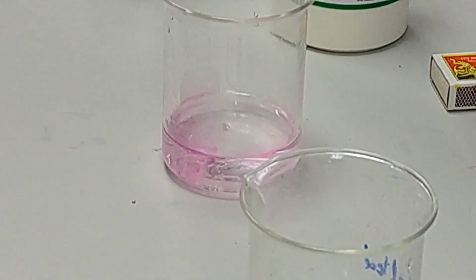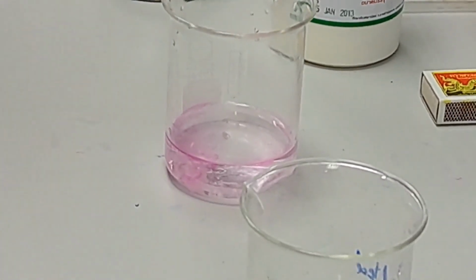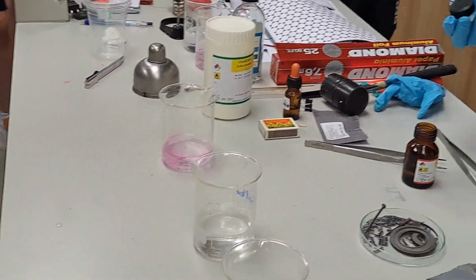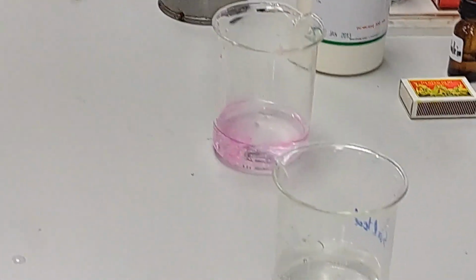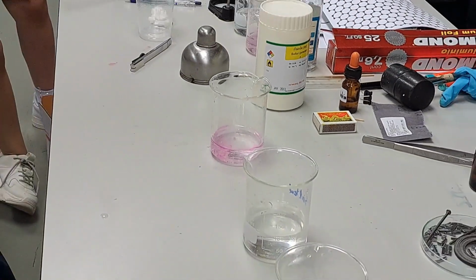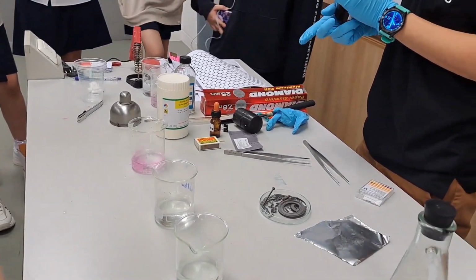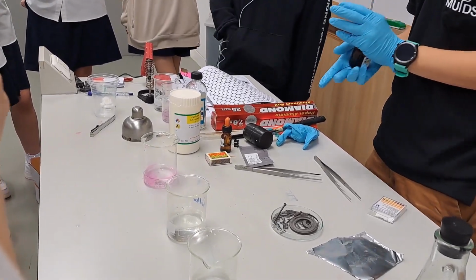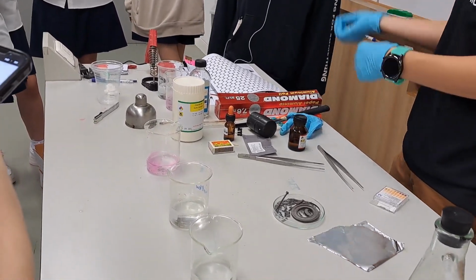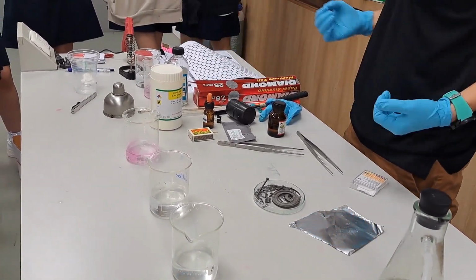Oh, where is it? Oh, it's in the middle. It's in. Okay, so one observation, the solution turned pink. That indicates the solution is basic. And back in the old days, in Greek, they called base alkaline. So that's why the first group of the periodic table is called alkali metals, because it's the metal that mixes with water and makes an alkaline solution, a basic solution.